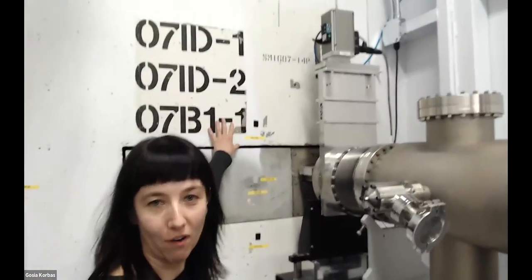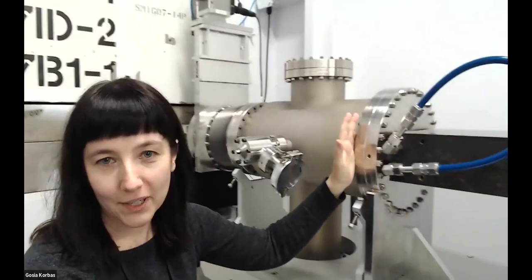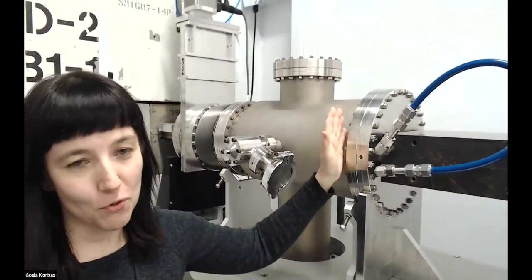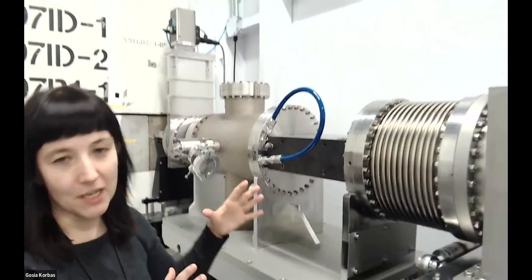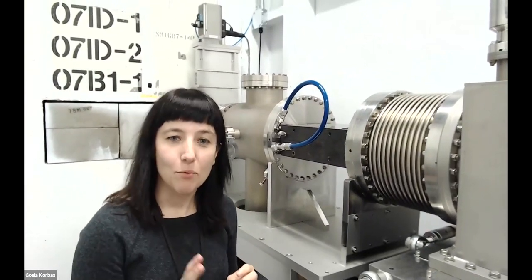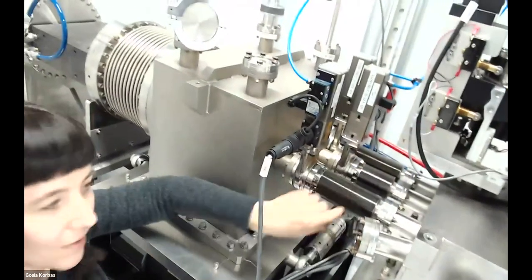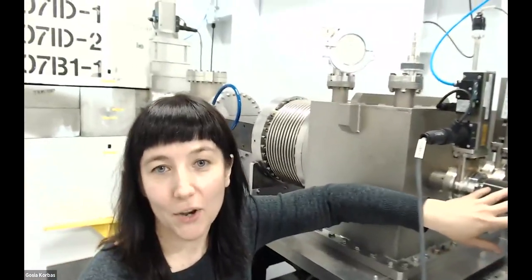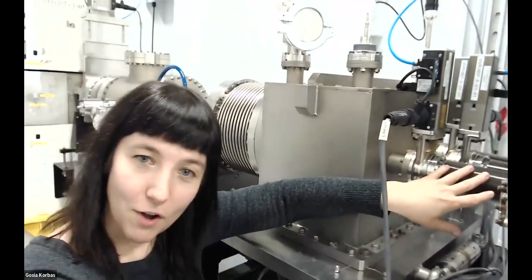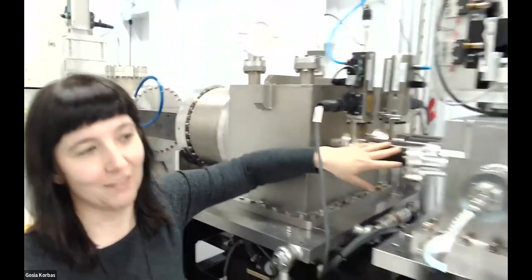So here behind that wall, there is the storage ring. This is where the light is made. And then the light, undisturbed, basically just light produced by the storage ring, comes here. And then we filter out from this beam that comes from the synchrotron 3 separate beams. That's why you see here 3 different beam types. So there's 1 and 2 and 3. And the one that is the closest to me belongs to the BioXAS imaging beamline, and we'll just follow the path of this beam, and we'll follow the light path as well.